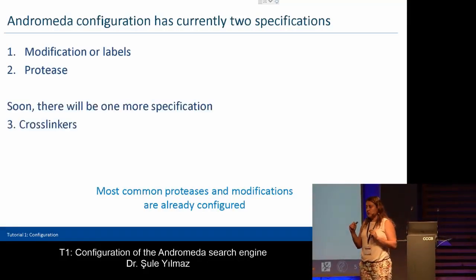You remember what I was talking about yesterday about cross-linking, and soon there will be one more specification where you can easily configure your cross-linker.